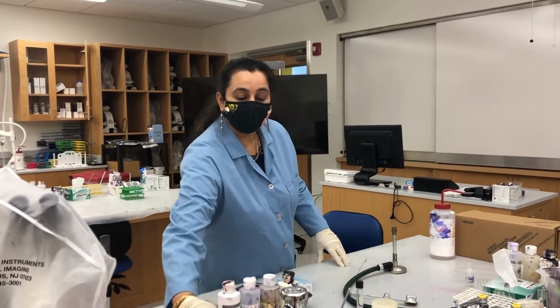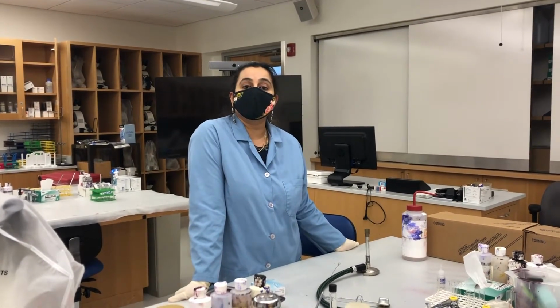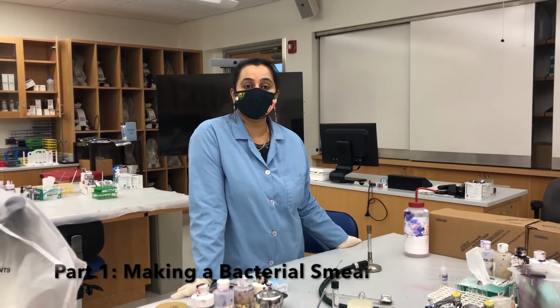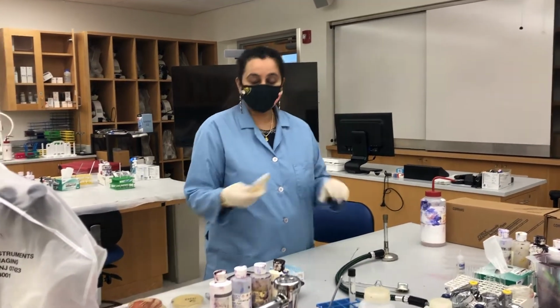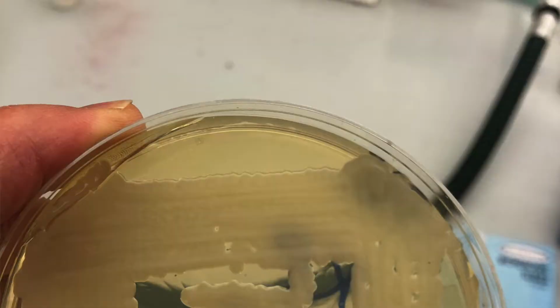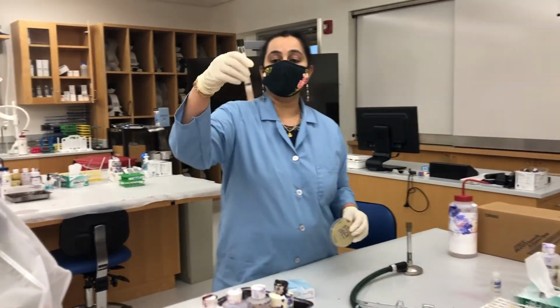Gram staining technique has two parts. The first part is to make the bacterial smear. So what exactly is making a bacterial smear? You take the solid culture. So this is the solid culture where we have Klebsiella pneumonia growing on TSA plates, or you can also take the liquid culture.